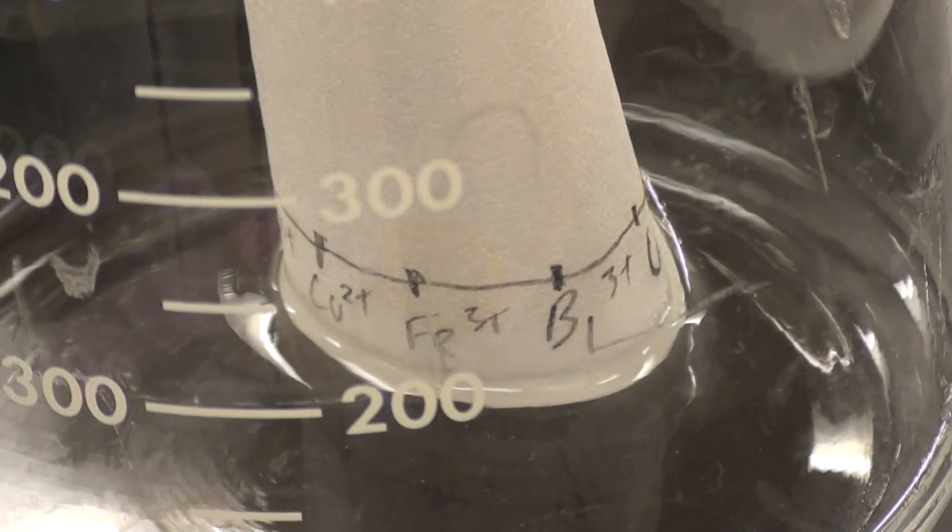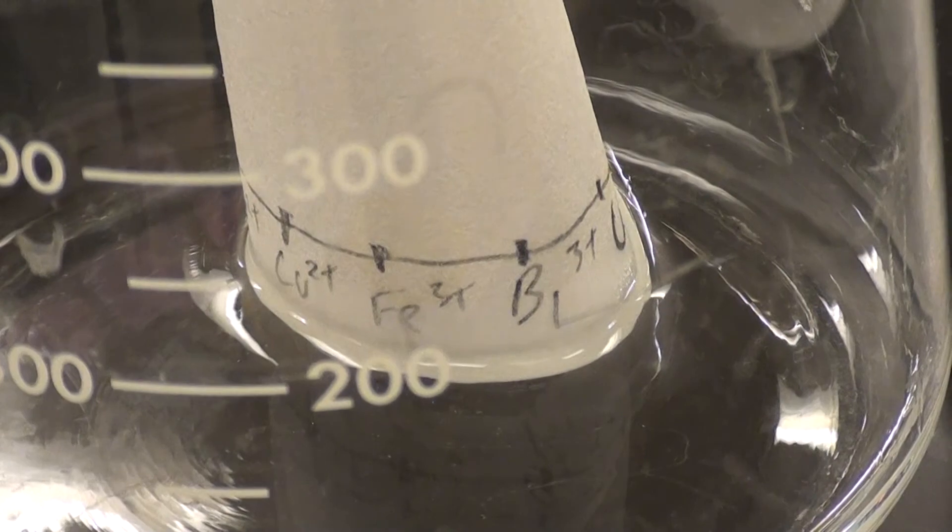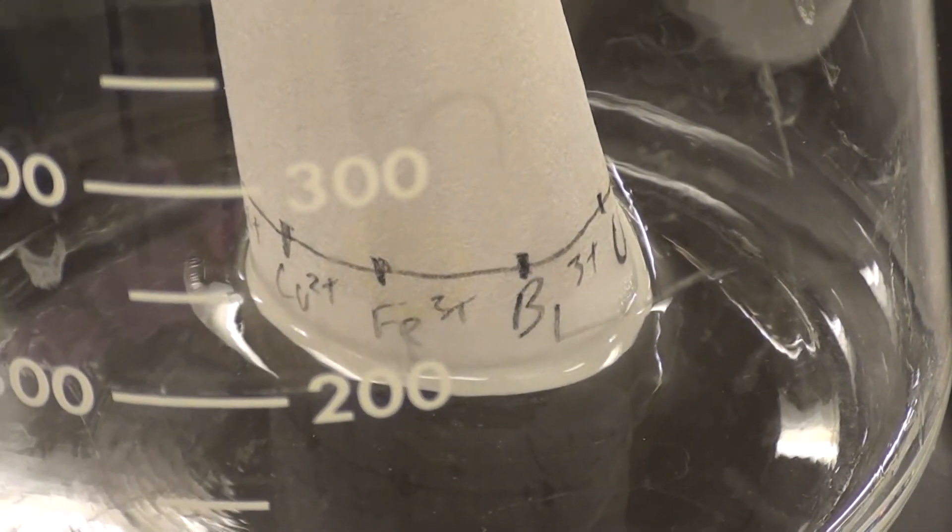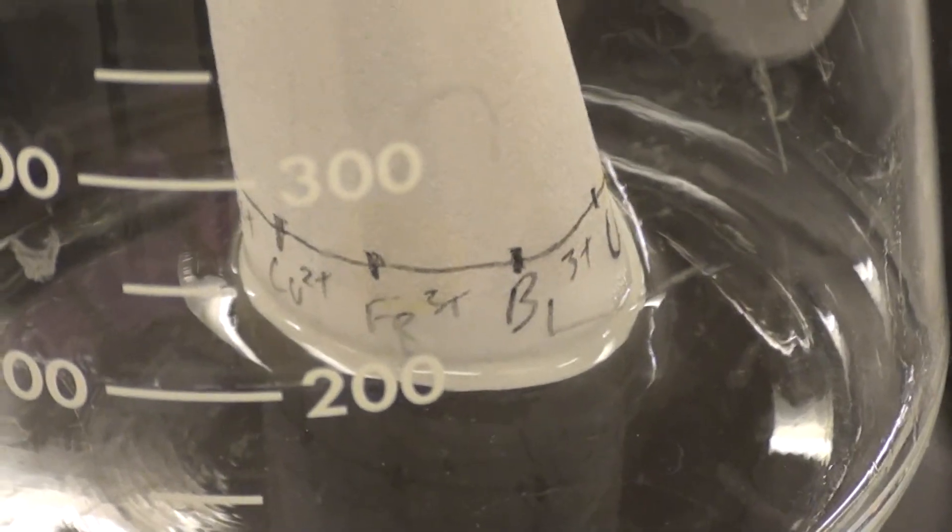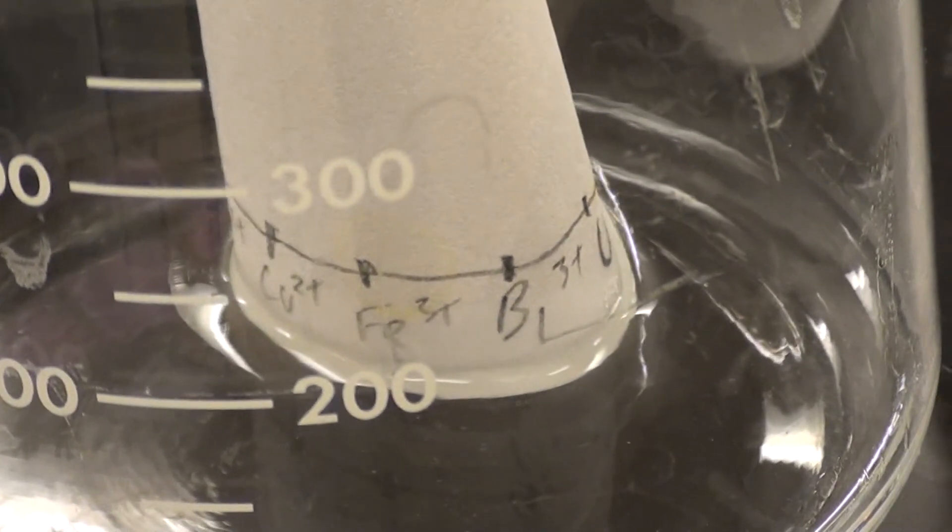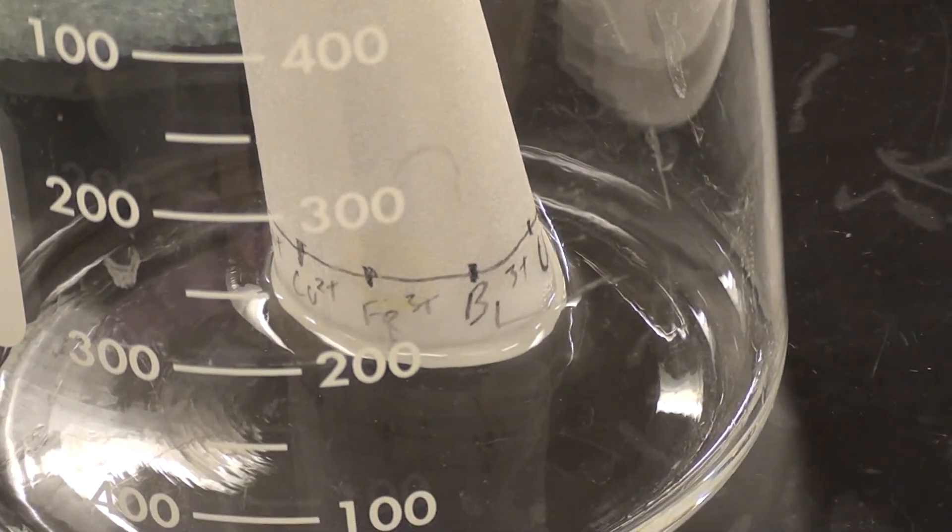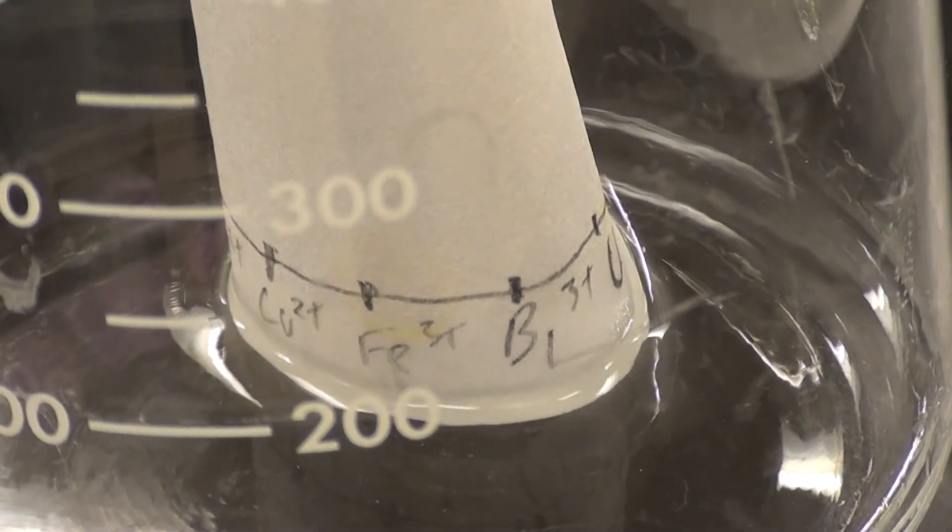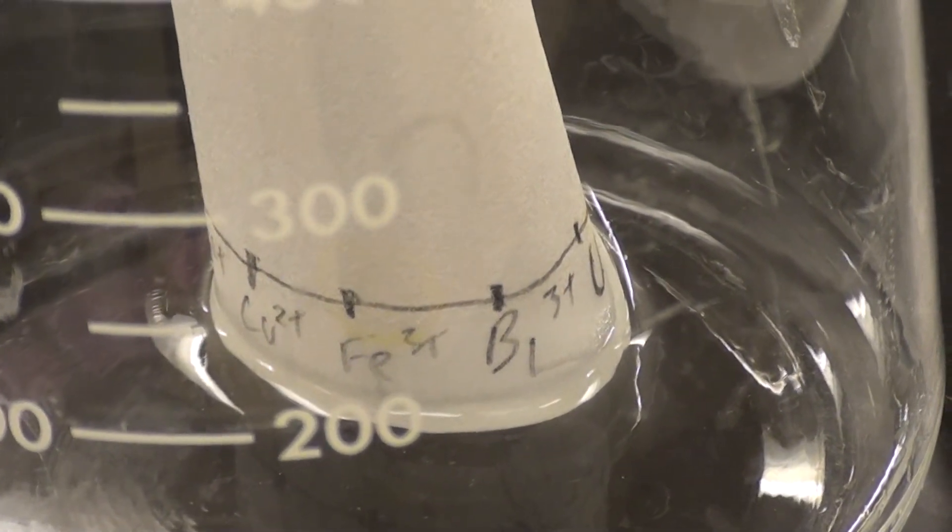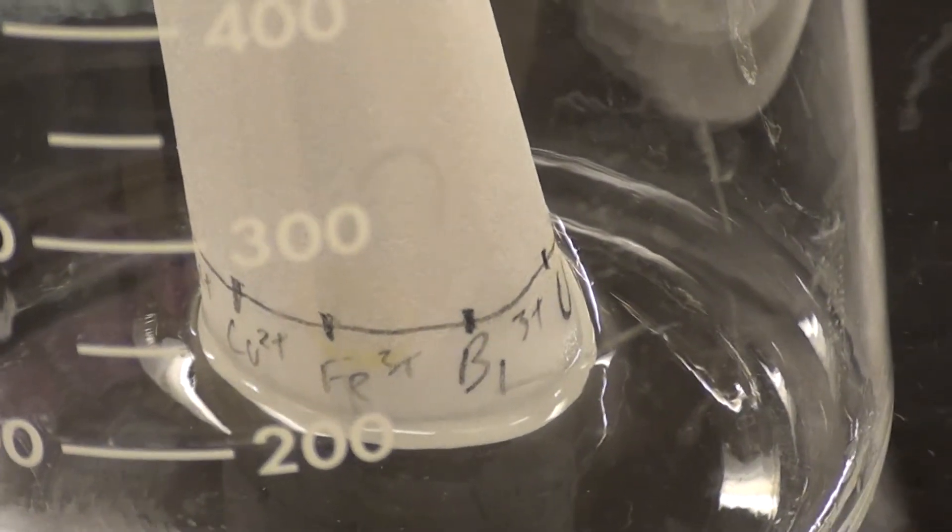And what's going to happen is, over the course of the next 30, 45 minutes, an hour, what's going to happen is that the eluting solution will move its way up the plate. And hopefully you can see that there is movement of this solvent line up the plate. I know it's a little bit hard to see here, but it is happening.